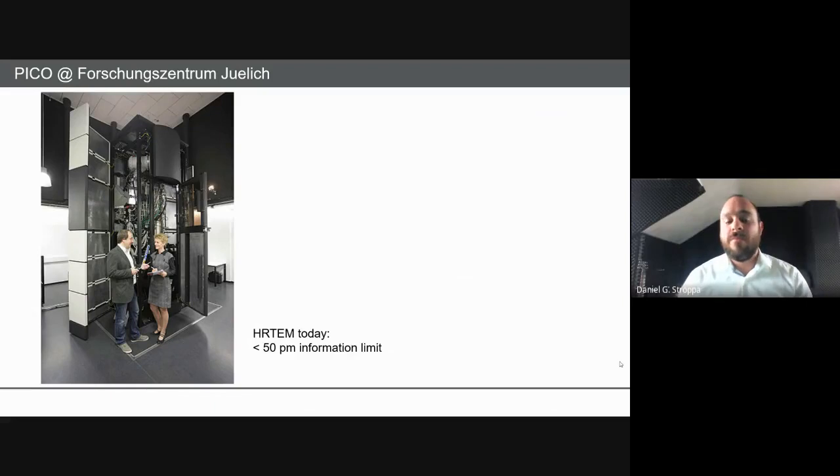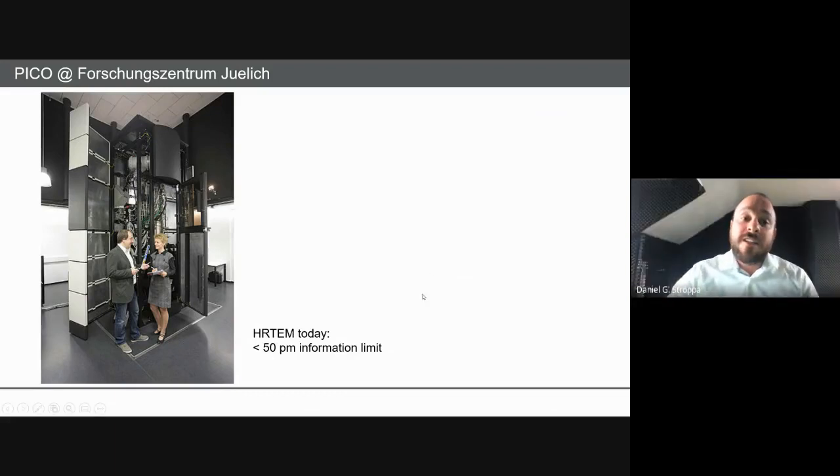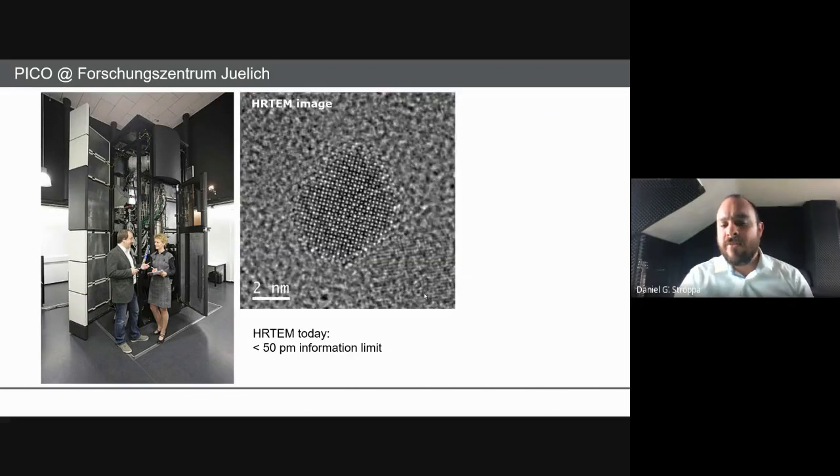Basically, that's a bit of how to process the image and how to investigate the sample. What we're able to do directly now is to correlate with the structure. Back then, I was trying to get information on the oxygen vacancy localization on the catalysts. So this is a bit on the mindset of TEM imaging.